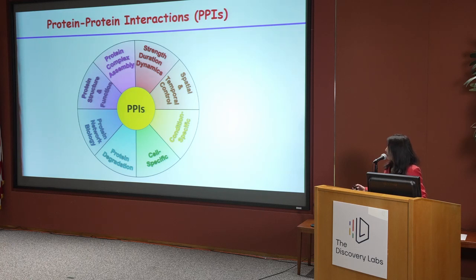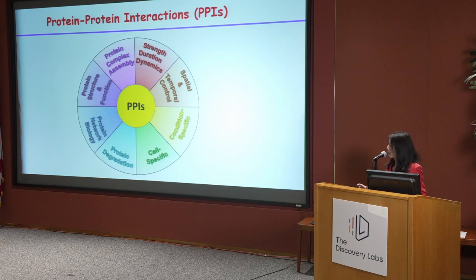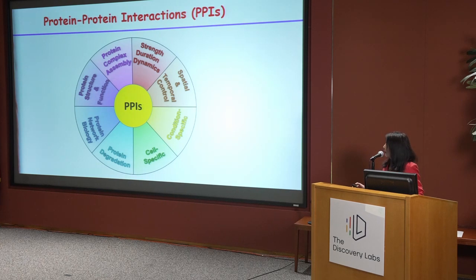And also that protein-protein interactions can regulate multiple cellular processes, including the examples that have been shown for protein degradation.